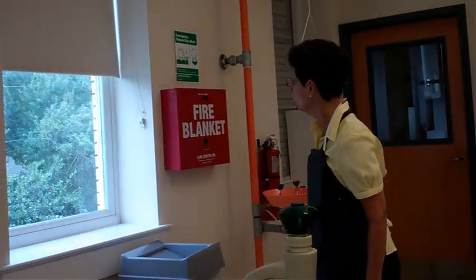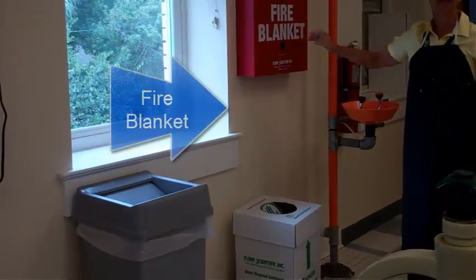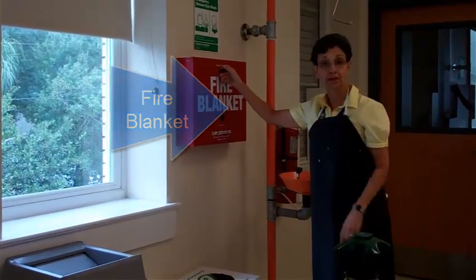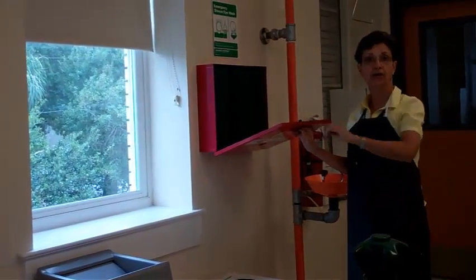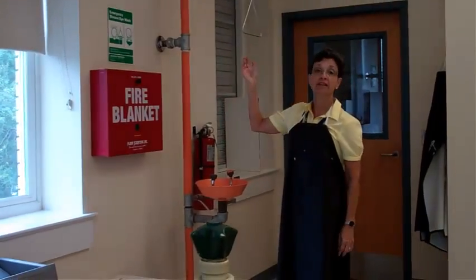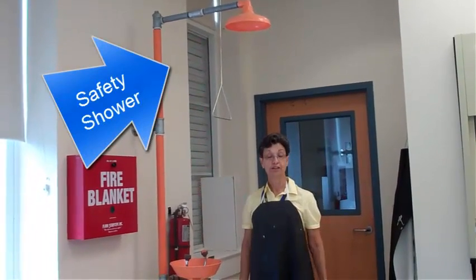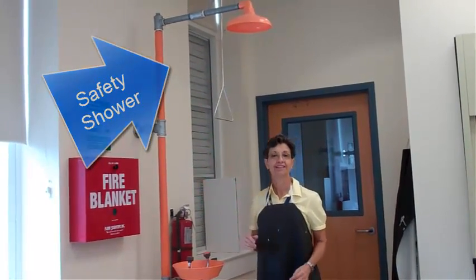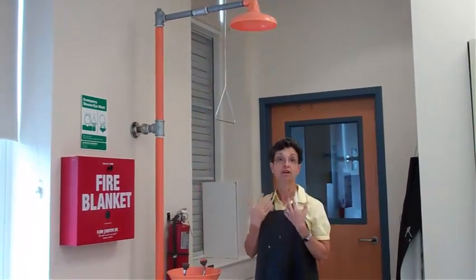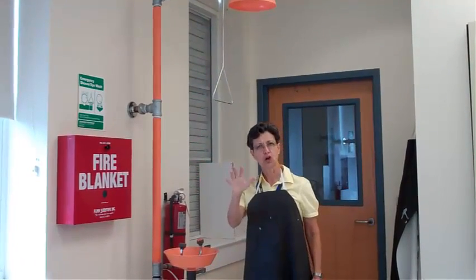Now I'm going to tell you more about our safety equipment. Here's the trash and we have a fire blanket. In the event that we have a fire or someone catches on fire, your responsibility as a lab buddy is to pull down, take the blanket out, and wrap it around the person that is on fire. If the person is close by, you can help them over to the shower, pull it down, and they will be drenched in water. The other use for the shower is that whenever you spill any acid or any caustic substance that could burn you, you will pull down and rinse it off with plenty of water. We'll talk more about that later.